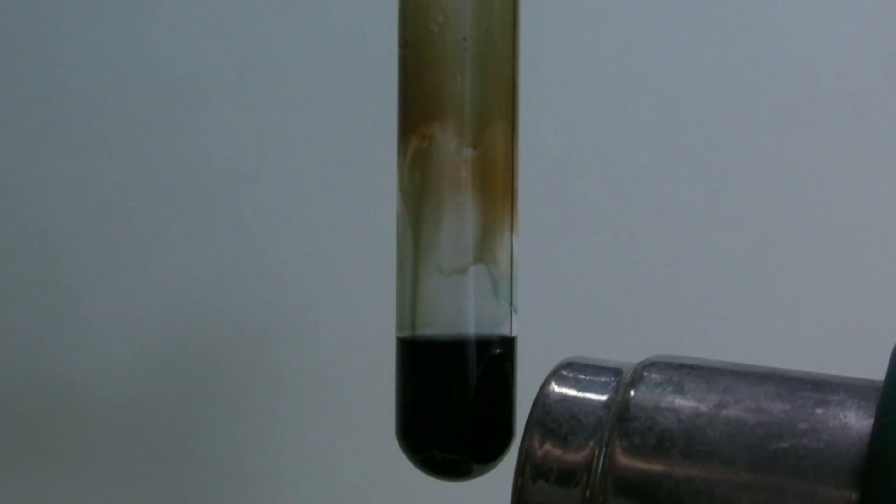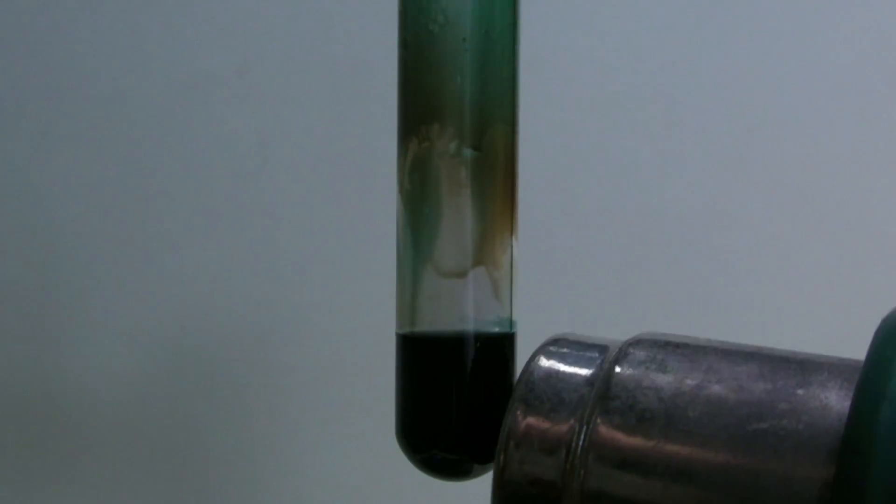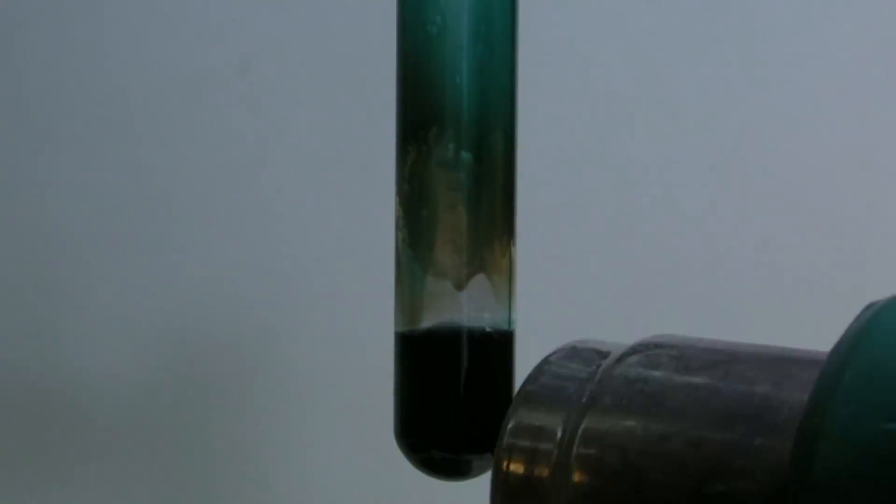When more iodine is added, the color is difficult to observe but can be seen very easily by heating the mixture until sulfur trioxide and iodine begin to condense above the solution.